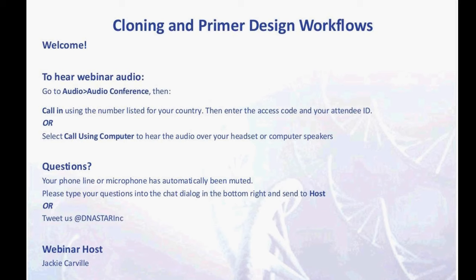I'm here today with Brian Anderson, who will be going over some of the functionality of DNASTAR's Lasergene cloning and primer design capabilities. You may have noticed that your phones have been muted.